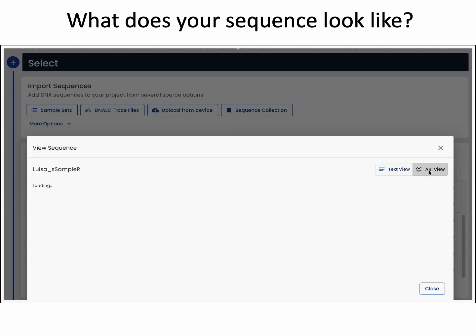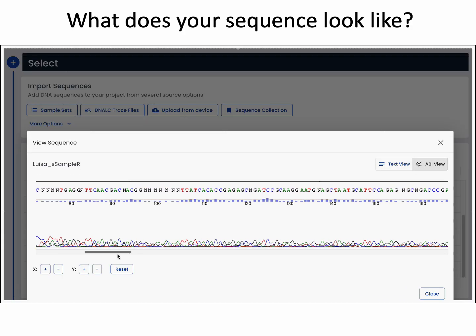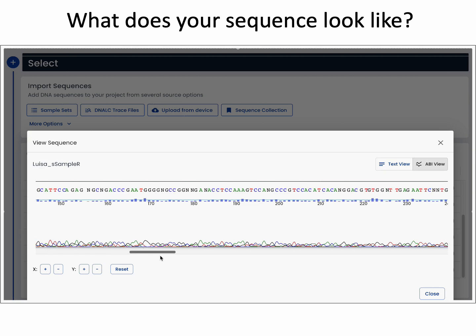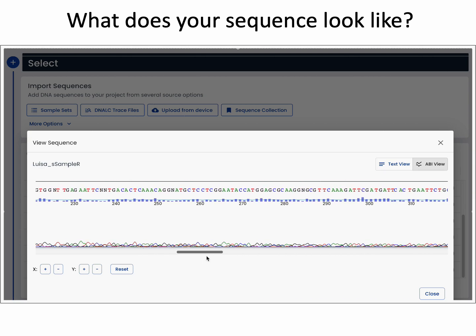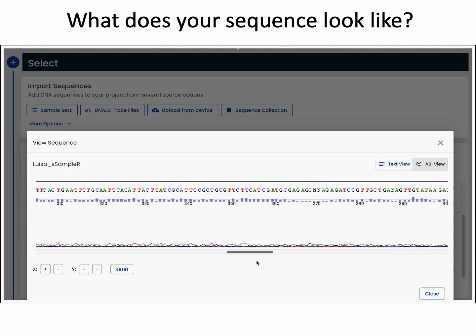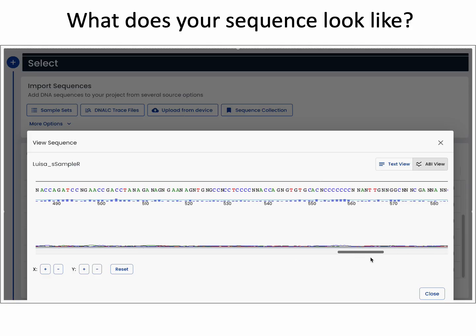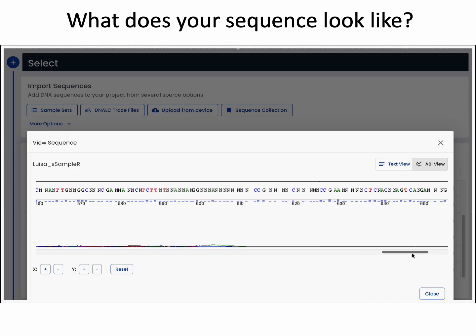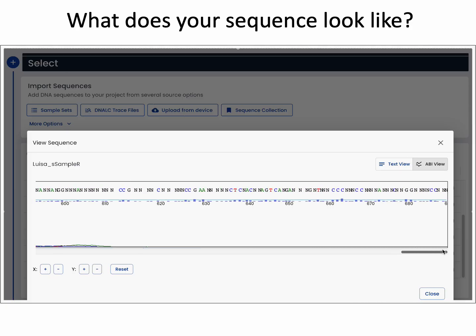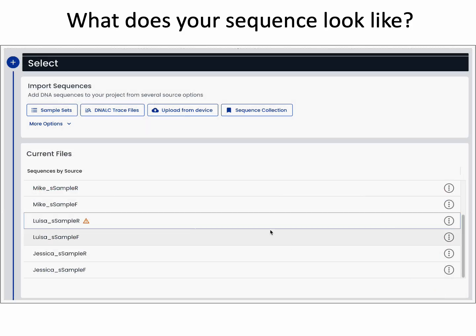Let's take a look at the AB1 view, and what you'll see is the waves at the bottom are all garbled, overlapping each other and not clean. And the individual purple bars or Phred scores for each of those calls rarely pass that Phred score of 20 threshold. And so most of these calls are low quality calls that can't necessarily be trusted.